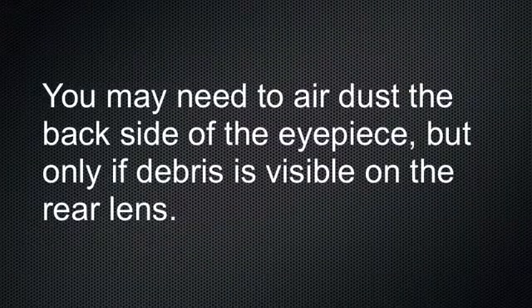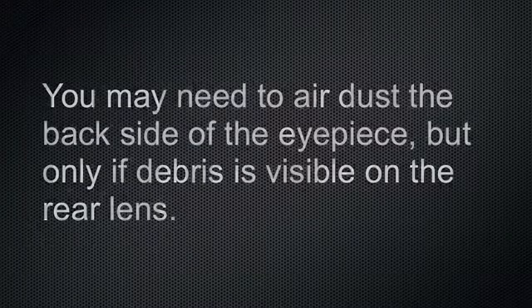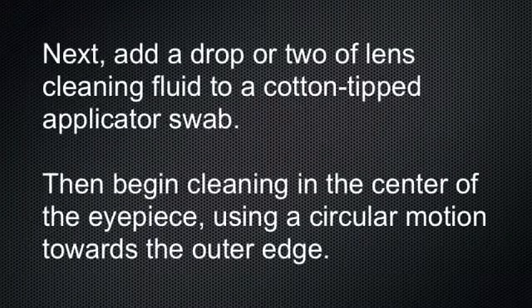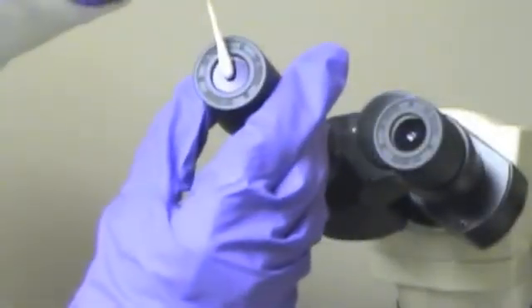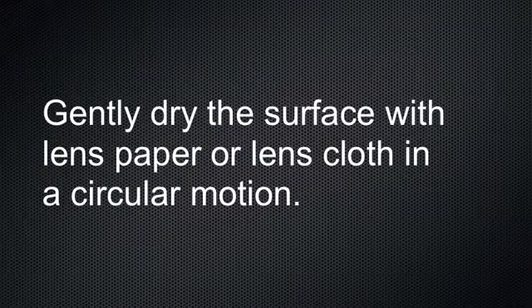You may need to air dust the backside of the eyepiece, but only if debris is visible on the rear lens. Next, add a drop or two of lens cleaning fluid to a cotton-tipped applicator swab. Then begin cleaning in the center of the eyepiece using a circular motion towards the outer edge. Gently dry the surface with lens paper or lens cloth in a circular motion.